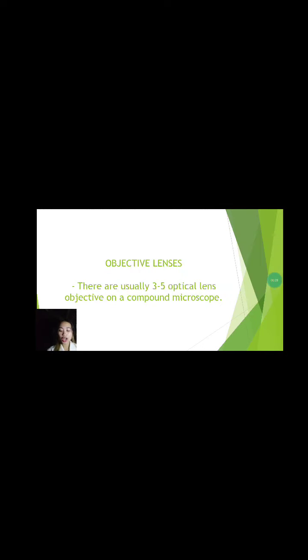Okay, there are certain adjustments on these lenses like 10 times, 40 times ang iyang gidak-on. Kanang mag-adjust ka kung unsay gidak-on, unsay ganahang gidak-on nimo pag inigtan-aw nimo sa object. Pwede po siya to the maximum level, pwede siya maabot og 100 times. So, ang 100 times are the most common magnifying powers used for the objects.